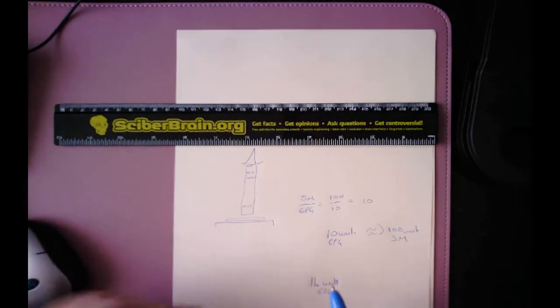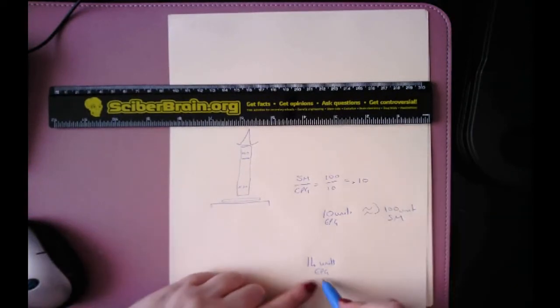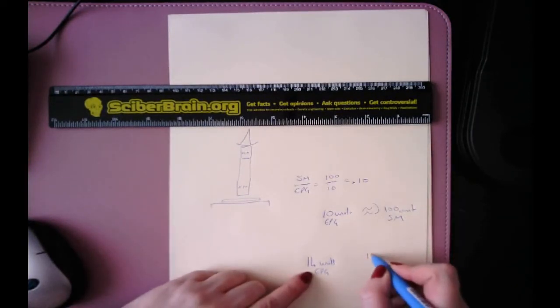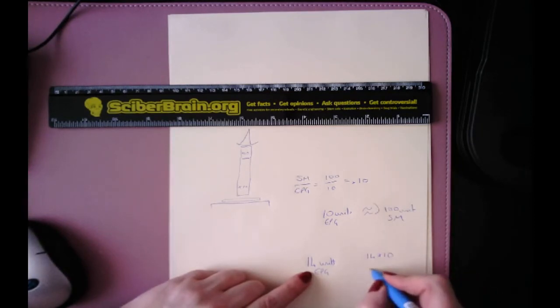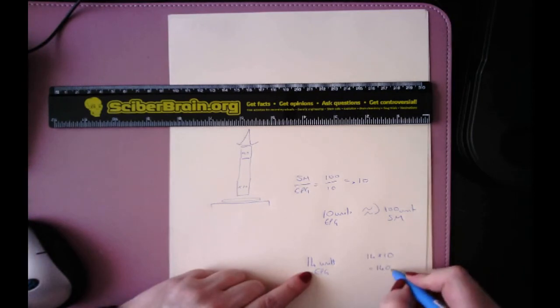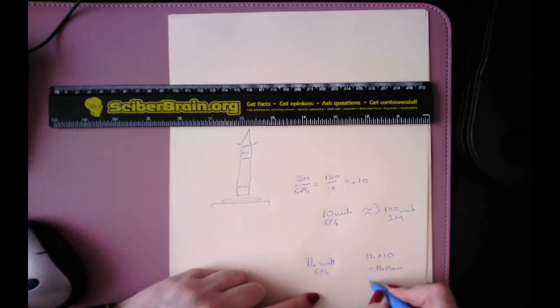My pen, for example, was 14 eyepiece graticules. So I just take the 14, times it by the 10, giving me 140, and we now know that this is millimeters, giving me 14 centimetres.